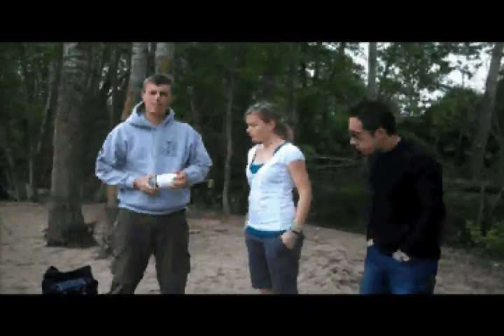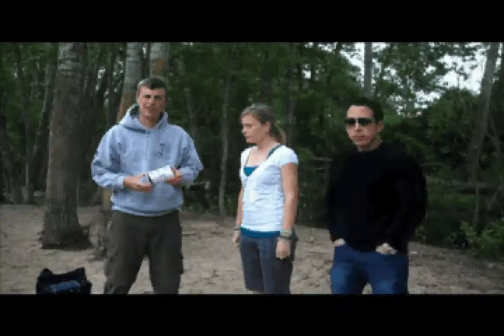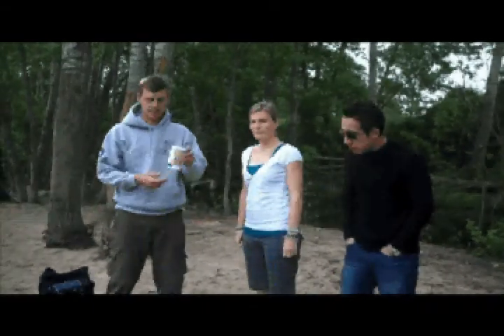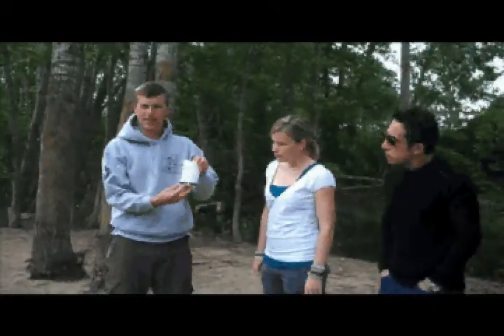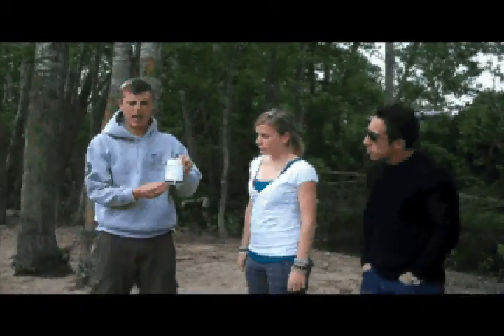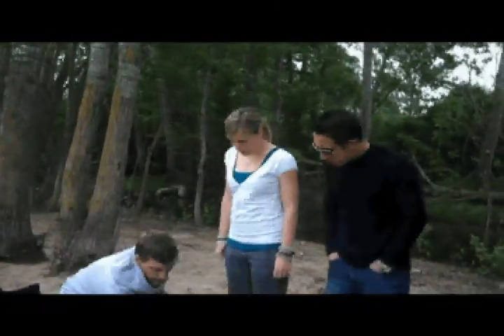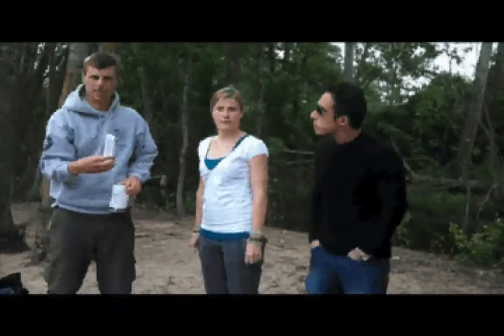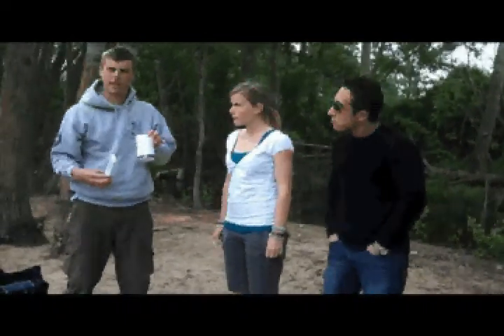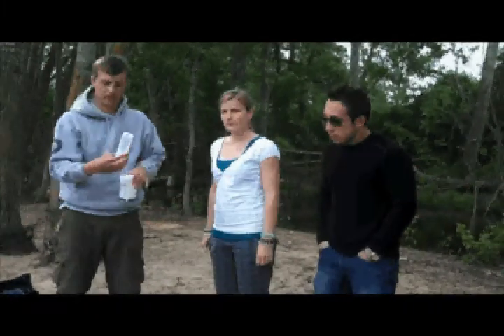Alright, so the first step for our water quality measurements is temperature and grabbing a water quality sample. Along the outside of this jar you can see there are temperature strips that respond to water temperature and provide a high and low range. We also have a standard thermometer that's measuring the air temperature for us. We'll just leave this on the bank. If this isn't working too well or you don't think the results are accurate, you can use this by just immersing it in the river.